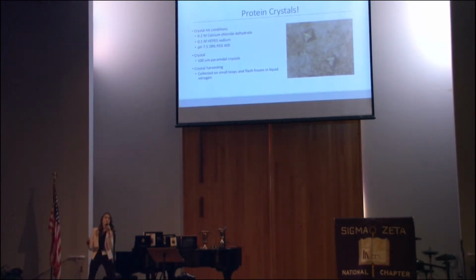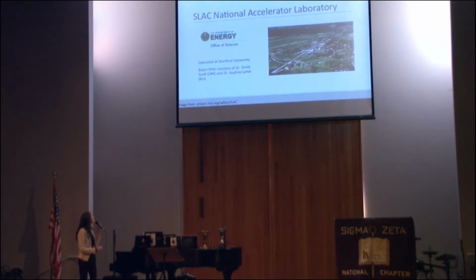And then we send these crystals over to SLAC. SLAC is the National Accelerator Laboratory, and I believe it's 1 out of 17 laboratories run by the U.S. Department of Energy, and it's operated at Stanford University. So this was a really cool experience. This lab is located in California, and we were able to control our crystals going into the beam from Missouri.